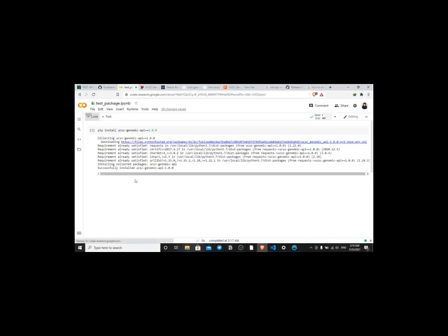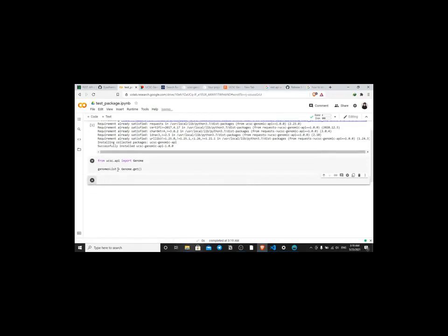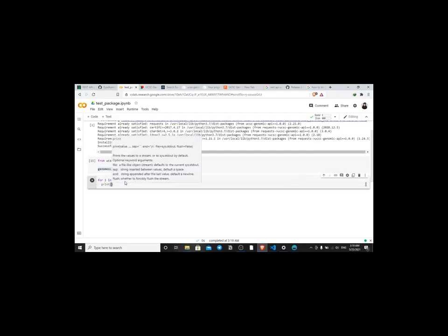So let's do something like this. Just copy and paste for saving time. It will not return any response, but it's now all saved in the genomes list. So if we loop over the genomes list, let's see, and to print, let's say the genome name. Okay, the genome name. Well, first let's make it a text so we can see all the objects in here.